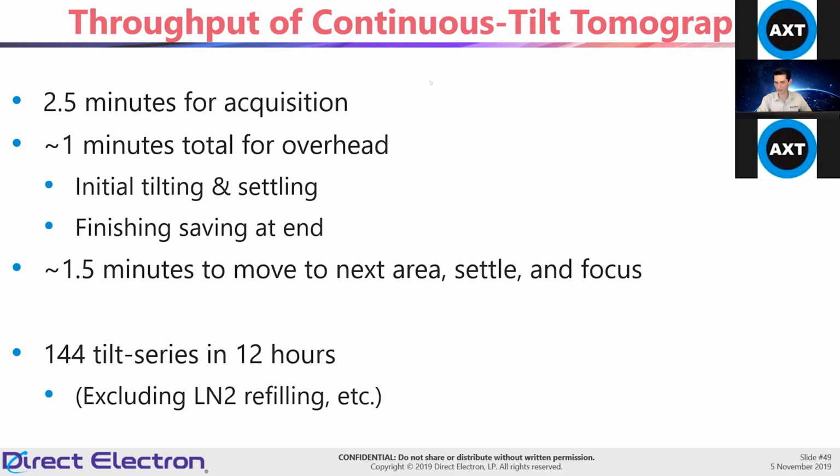So the question is, are we releasing and managing SerialEM scripts? The answer is we're not managing them, but we're working closely with all of our customers that are interested in this to make sure that it can work and that the camera side of things doesn't have a problem. Because basically, the SerialEM scripts aren't technically limited to a DE camera. You just set up your exposure acquisition and tell it to take this continuous tilt, and that's pretty much it.